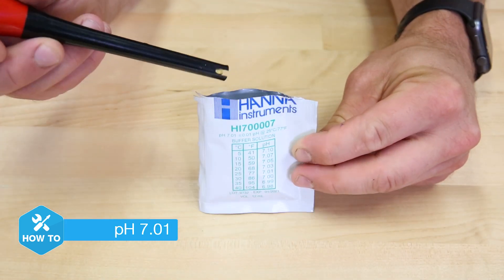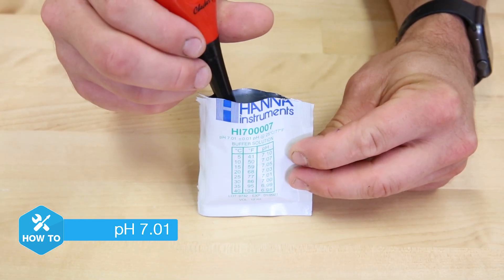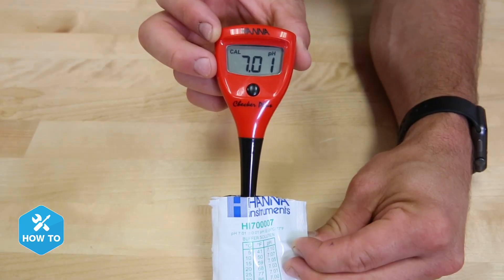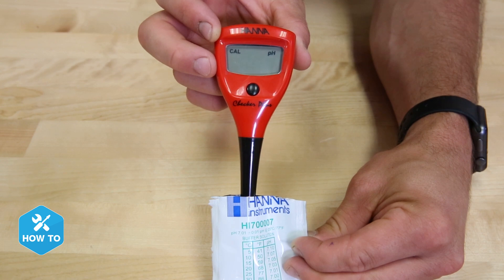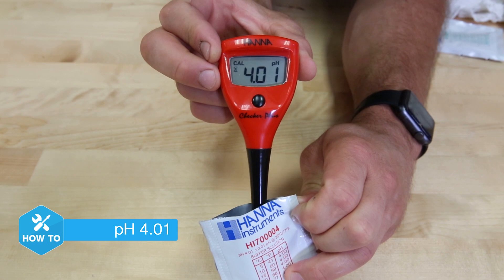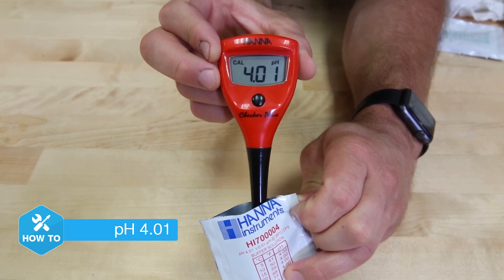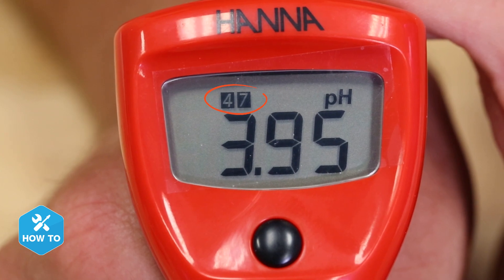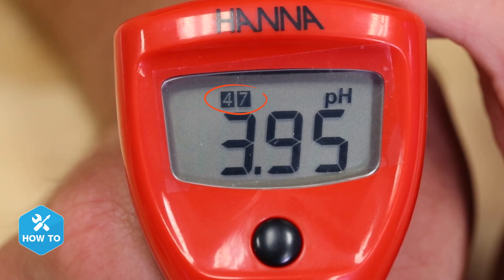I'll remove the protective sensor storage cover and dip the tip of the pen into the first 7 pH solution. When the hourglass stops blinking and the screen changes to 4.01, you're ready for the next solution. After the calibration settles using the 4 pH solution, the screen will store the information and exit back to the main screen. Here I can verify that it's calibrated by seeing the 4 and 7 indicators, and I'm ready to test my tank.